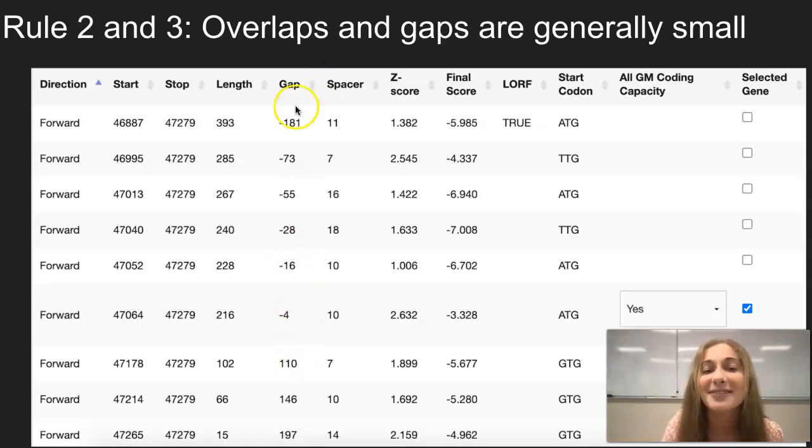So this negative 181 overlap is very large and this 110 gap is also very large. This negative 4 overlap right here is the best option out of all of these choices and it provides even stronger evidence in why we should choose this start of the protein.